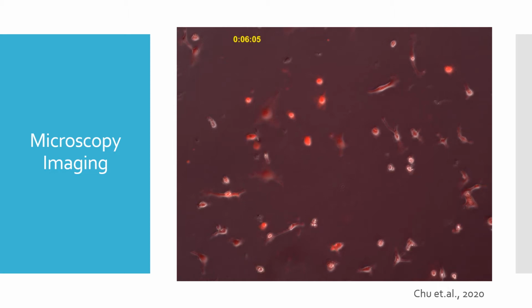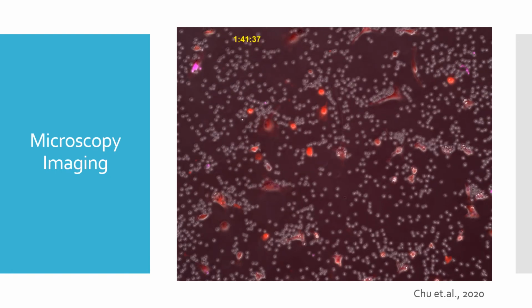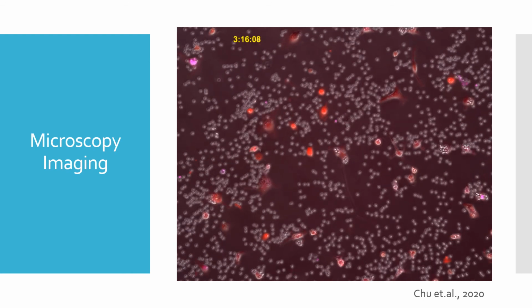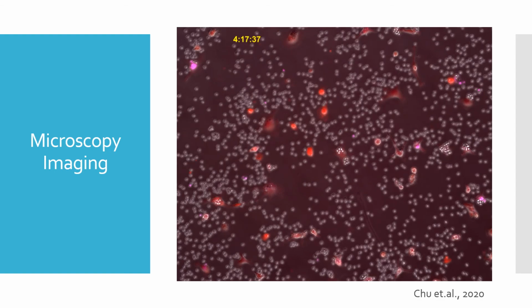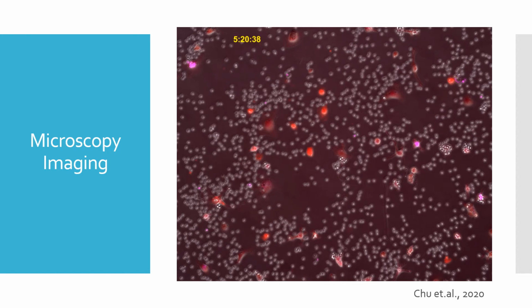However, as you can see from this video, it results in enormous amounts of image data consisting of approximately 100 macrophages imaged every 1.5 minutes for up to 12 hours. At this scale, analysis is daunting and requires tracking of hundreds of macrophages and thousands of tumor cells over hundreds of video frames. So our goal for this project was to develop an automatic program capable of tracking these events in place of manual analysis.